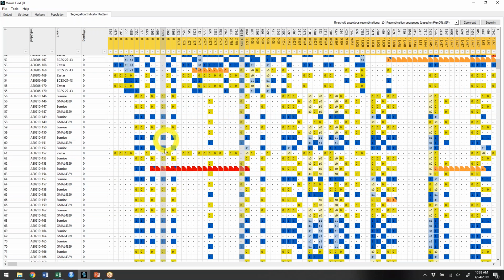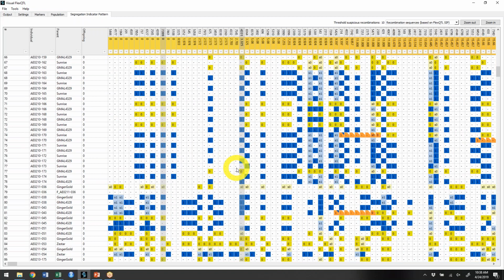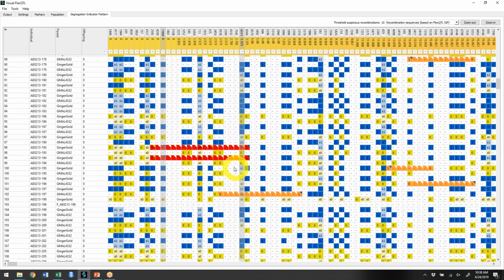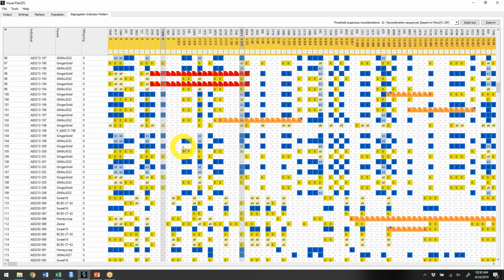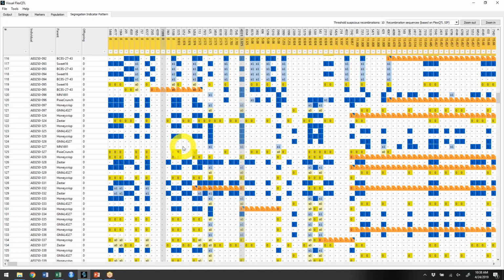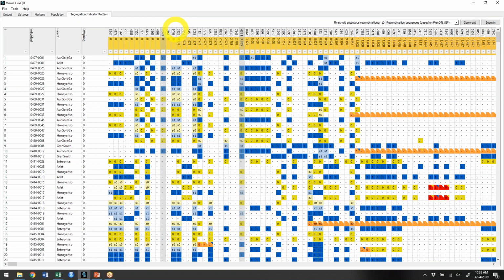Now here we see another individual where, if I move this all the way here, it would actually also solve this recombination for this individual. So this is great. So yes, I should probably be moving this marker around. These are the two individuals I saw before. And then as I'm looking through all individuals, I will not find an individual where I would cause a double recombination just by moving this to here. And that way I know now that I can safely move this marker behind this marker.